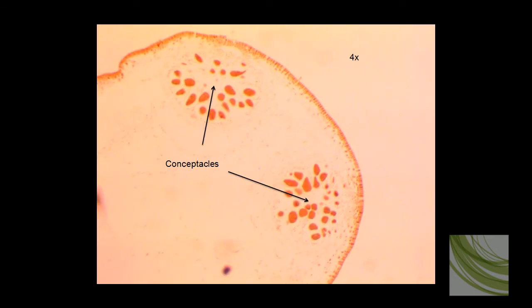Here is the first slide of Fucus using the 4X objective. We can see these concepticles, which are female concepticles. As we get a little higher magnification, we'll be able to see several other structures inside.